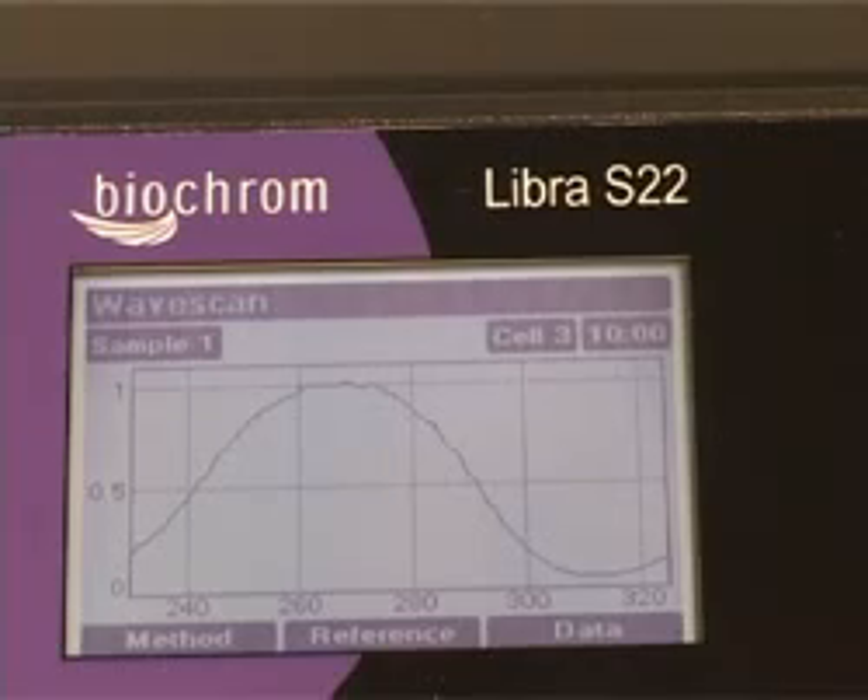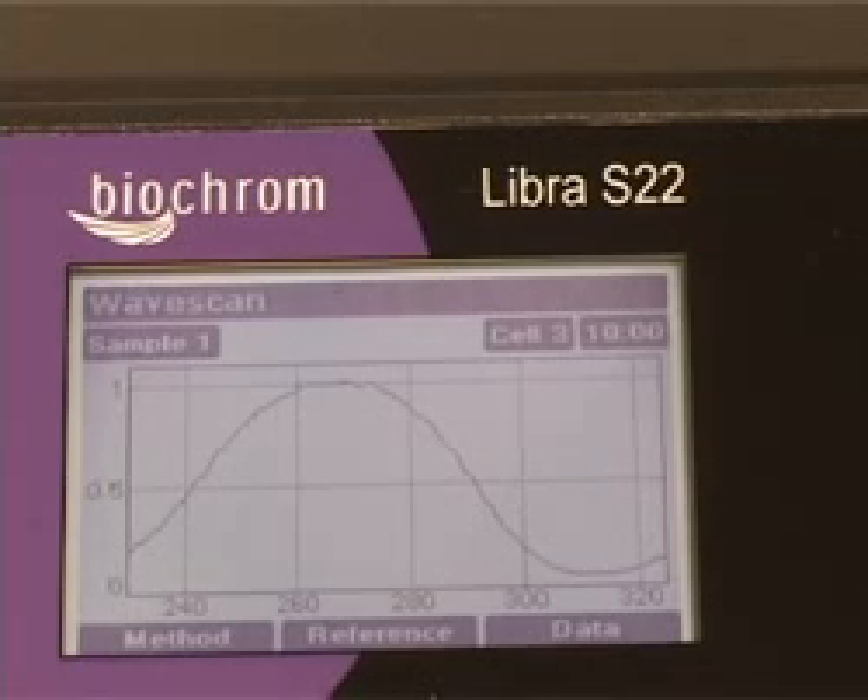For extra data handling flexibility, the Libra S22 can also be controlled using the optional Acquire PC software.